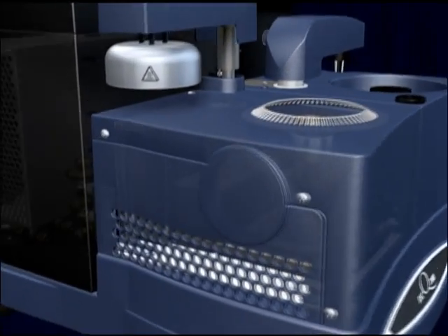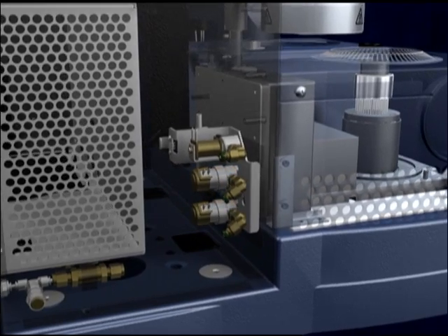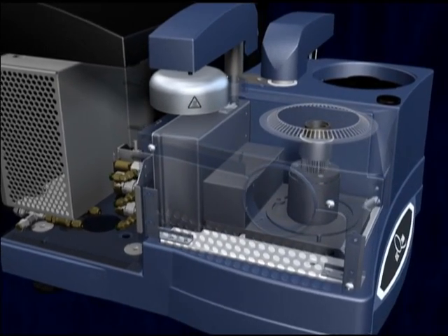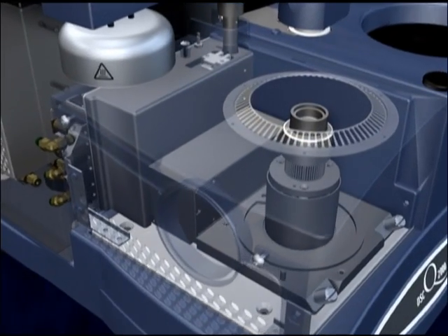The Q-Series DSC incorporates dual digital mass flow controllers, which guarantee efficient gas switching. User programmable flow rates are recorded automatically for subsequent analysis, and purge gas is preheated to ensure a uniform temperature environment.